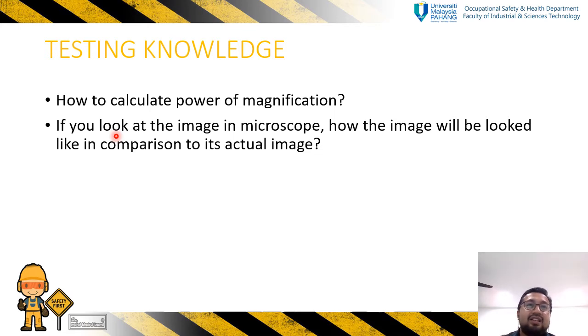Okay, second question. If you look at the image in the microscope, how will the image look in comparison to its actual image? How is it actually? Does the microscope give us the real picture, or how does the image actually represent it? Okay?